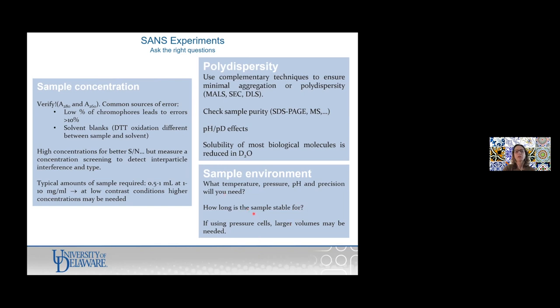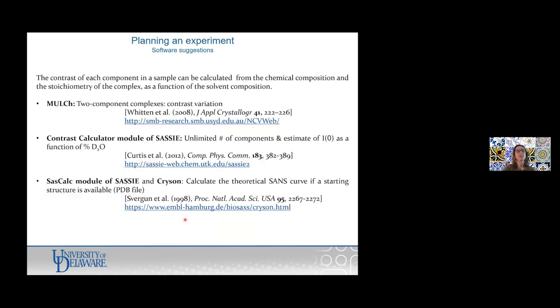And for example, if you're using pressure cells, if you're investigating phase diagrams, for example, you may need larger volumes. So I think the overall message is that you have to think about all these things, but also my strong recommendation is to discuss these things with instrument scientists. They're happy to discuss it with you, and they can alert you to different aspects that you may not have thought about ahead.